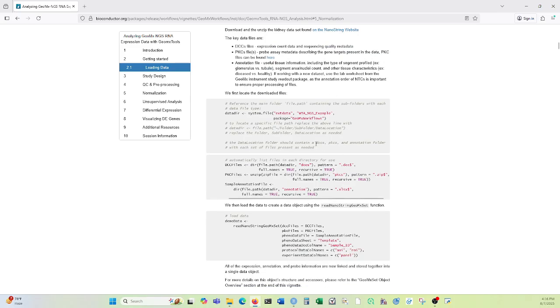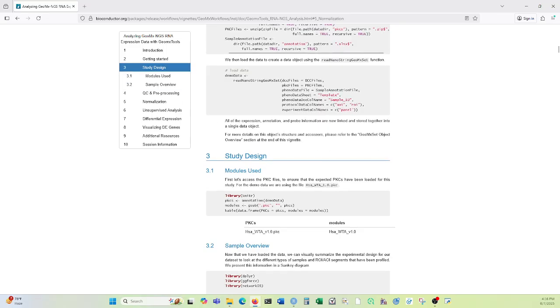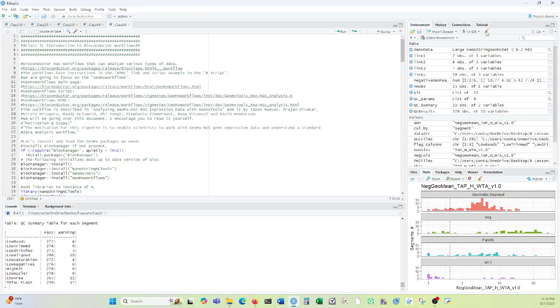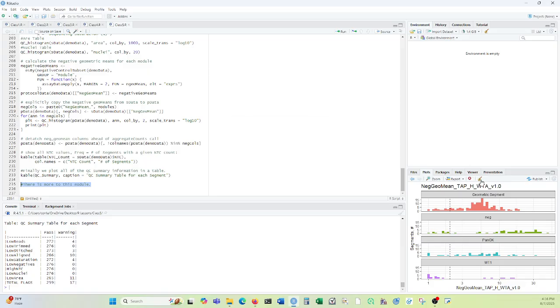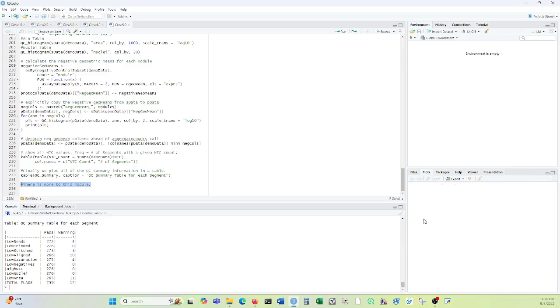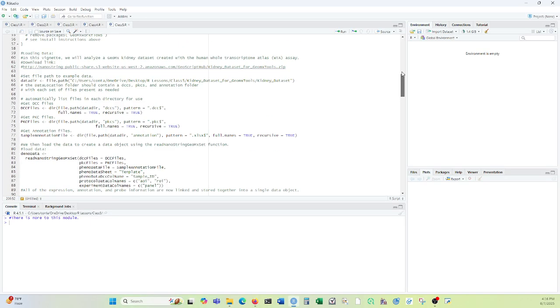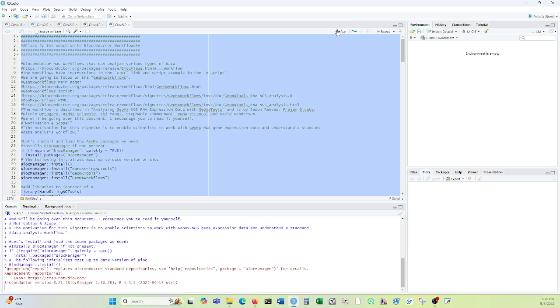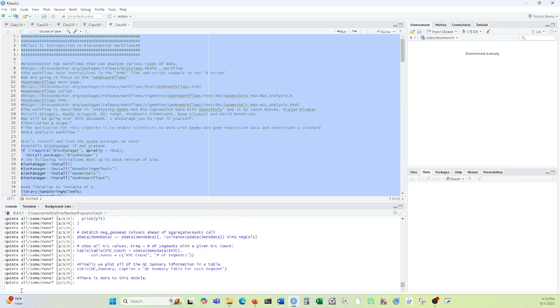You can be like, oh, this seems like a lot of work, but if you just make all this, for example, all this stuff right here, I'm just gonna clear all the data, yes, clear all that, and I'm actually just gonna run all of it. Oh, sorry. I'm going to select all, then run. It's going to run everything.